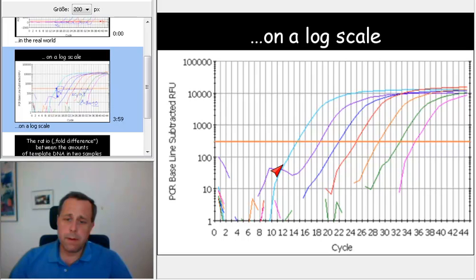Now using that linear graph makes it much easier to visualize the delta CT because now you can see much better how your amplification curves will cross the threshold that we are using to measure the CT and delta CT values. And if I now get my pen again I can tell you quite accurately that this here is our first delta CT and that the delta CTs for the subsequent samples can be delineated as shown here.